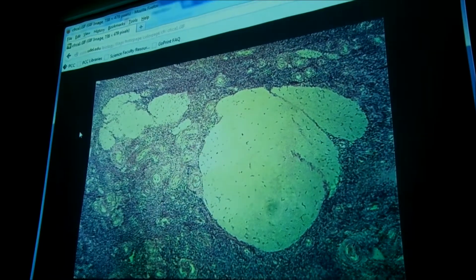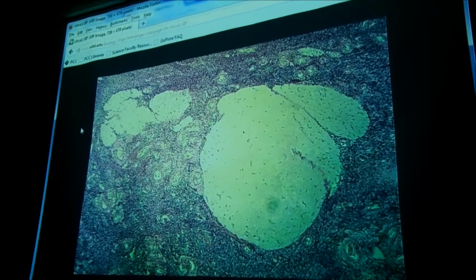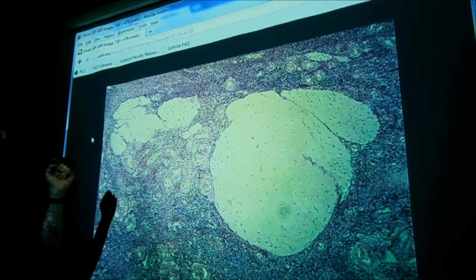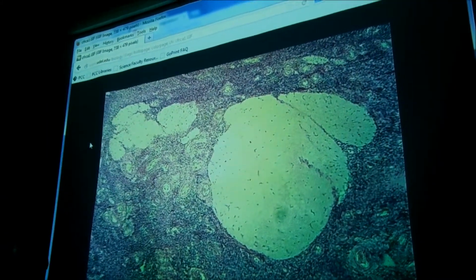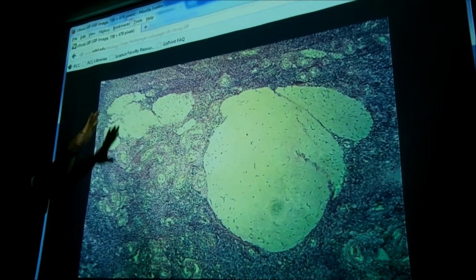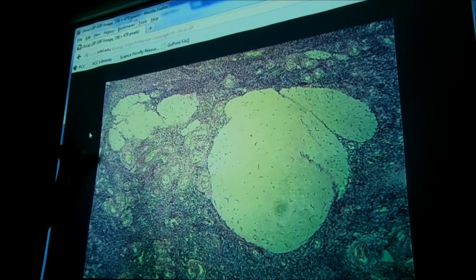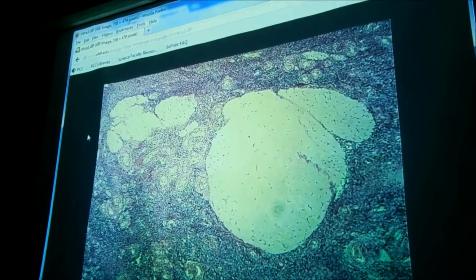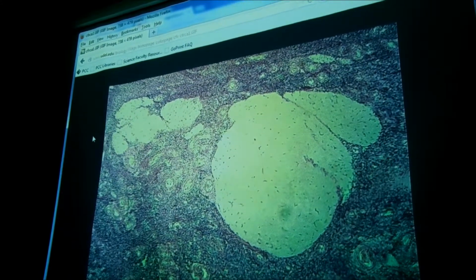So then we're going to do the upper left, compared to the right. Albicans. How'd you know that was an albicans? It looks like one. Yeah, they're shrinking, right? So the luteum gets smaller and smaller and decays and becomes an albicans. They look kind of the same, just size is different. This one looks a little more destroyed. So that large one on the right is a luteum trying to become an albicans.